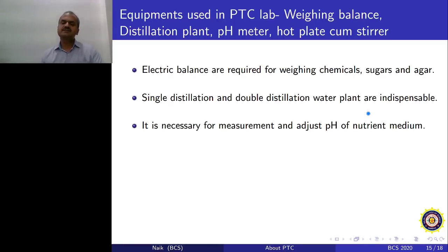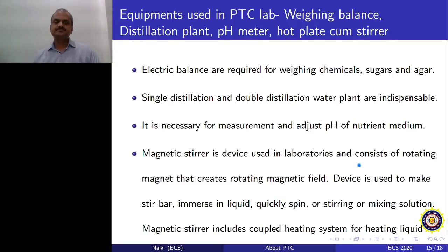What we keep in India is generally 5.8, because the agar generally polymerizes or solidifies at that particular pH, and therefore it is good to keep that pH. There are also other reasons: at this particular pH there is a reasonable amount of ionic transfer which happens from cell to cell in our explants.